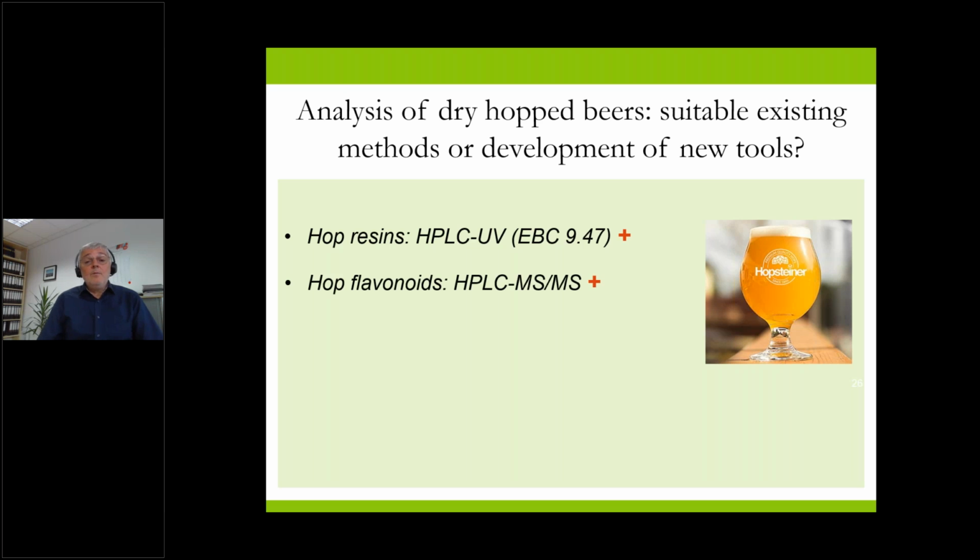So the next answer we have is that for hop flavonoids, I would recommend this HPLC-MS method or another, similar one, but we know this method that we have published works.